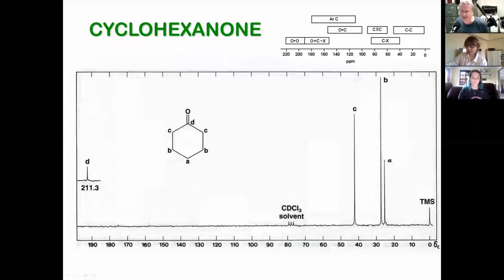We're finishing the sixth lecture, which is the carbon 13 NMR, right? And I showed this as a cool example of the beauty of carbon NMR. It's not a totally crazy molecule, but we got some different carbons. We see every carbon. Each carbon is represented nicely. Remember, the double-sized peaks tell you there's probably more than one carbon, right? We don't use integration. We don't really use splitting, but we do see the largeness of peaks and where the peaks are, right? And then the ketone is 211, way down on the left, okay?